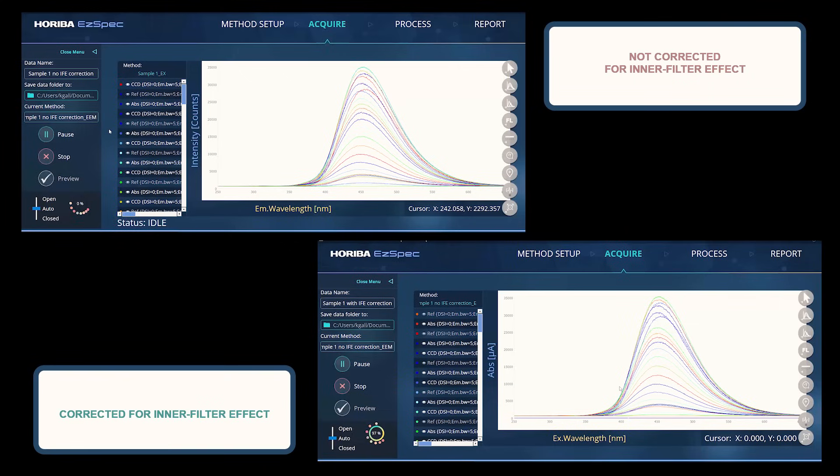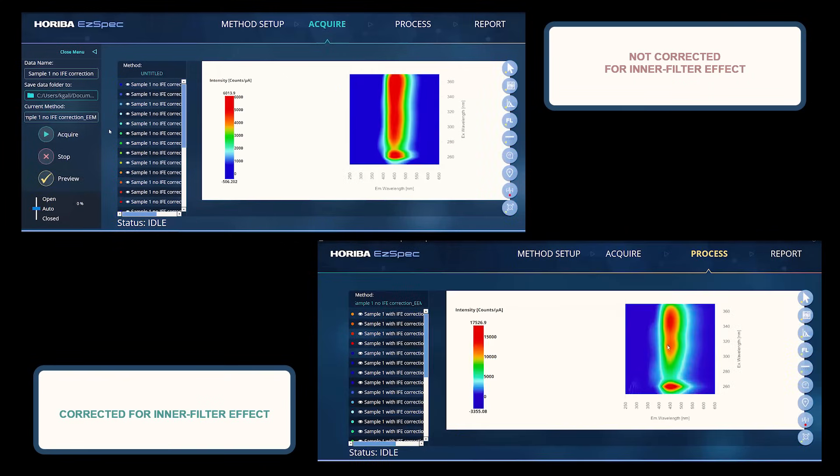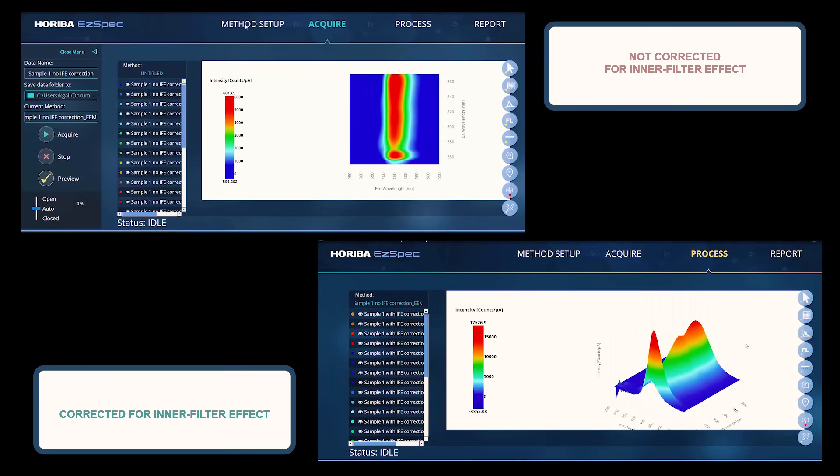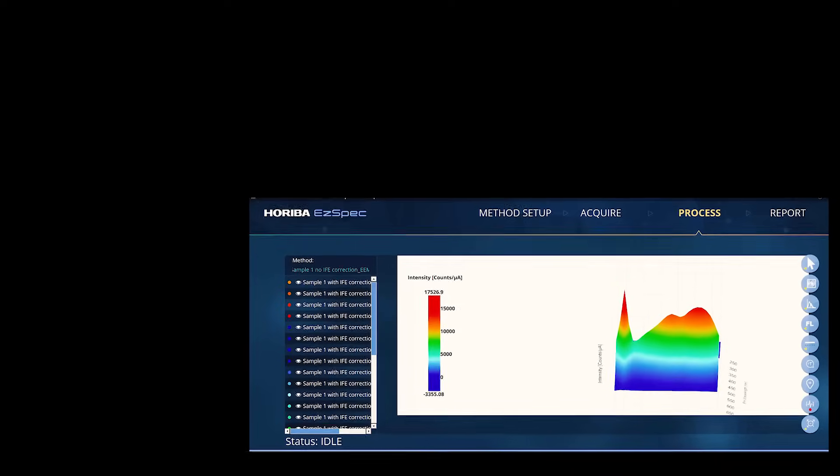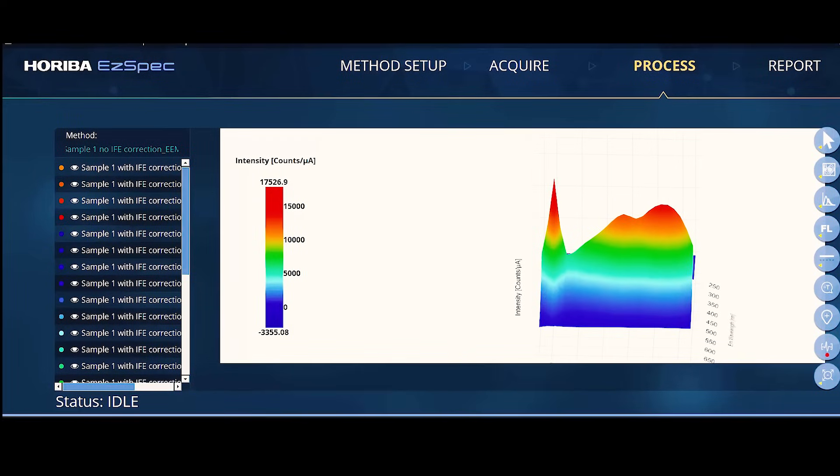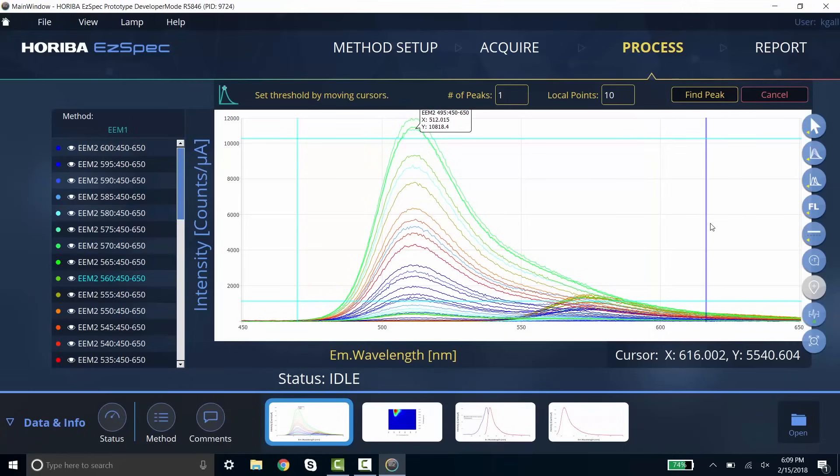This unique fluorometer capability extends the dynamic range of any given fluorescence experiment. This exclusive inner filter effect correction extends the dynamic range of experimental concentration.